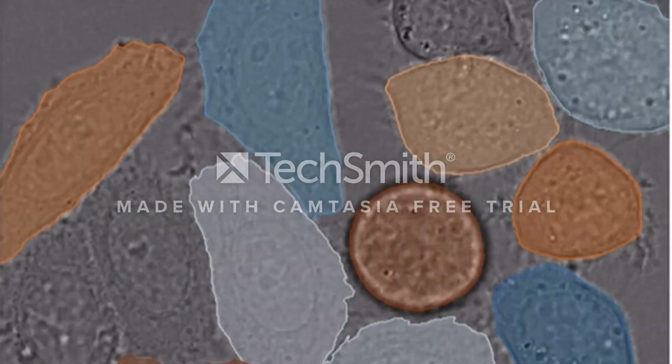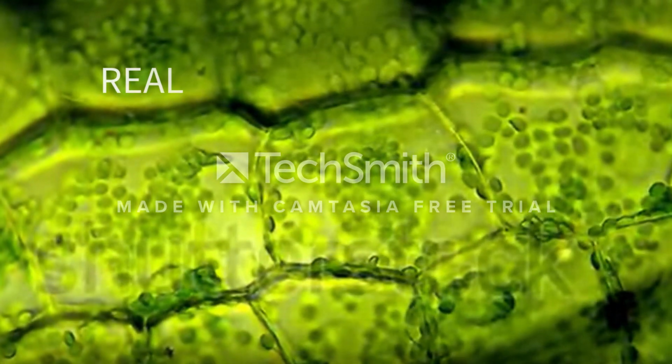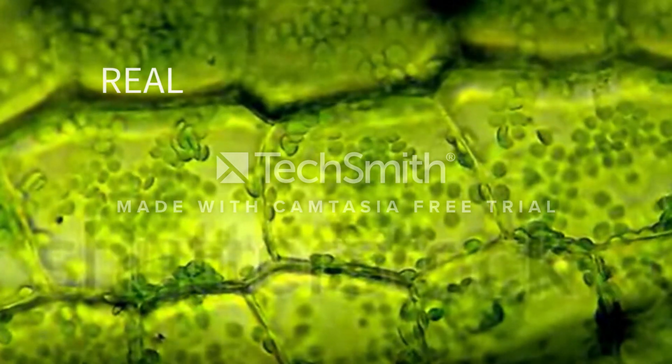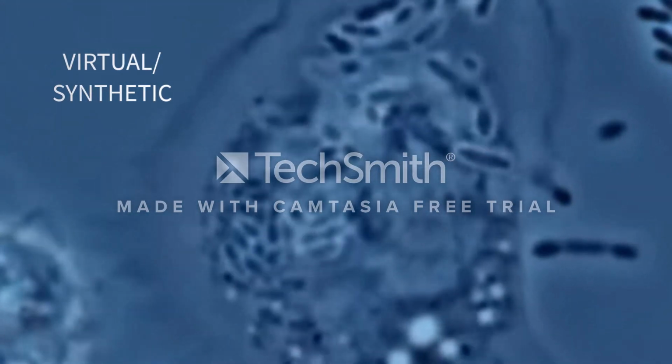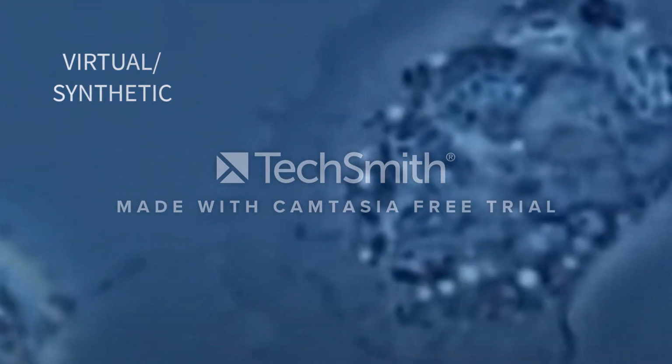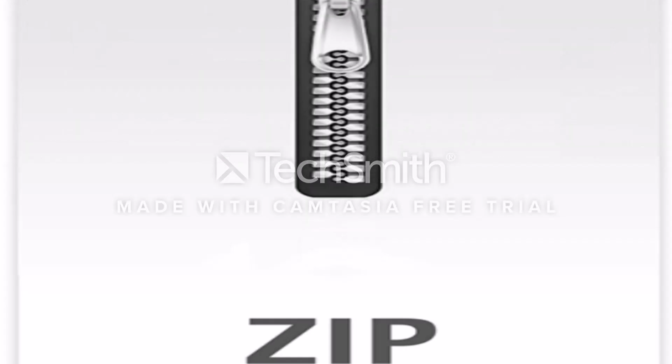Out of the available data, some of the examples consist of real datasets that were captured through various media, and the other part consists of virtually generated datasets. The virtual datasets can also be looked upon as synthetic datasets, which are generated with the help of augmentation techniques. The datasets are further divided into training and testing data, out of which the reference annotations are available for the training data. We will understand regarding the annotations in detail further in this video. All the datasets, including training data, the corresponding annotations for it, and the testing data are distributed and available in the form of zip archives on the website.